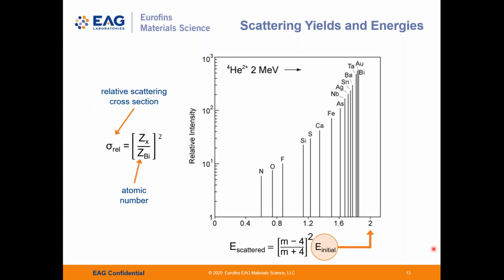Okay, some observations. Scattering cross sections are proportional to the square of the atomic number Z. As a consequence, there are greater backscatter yields for heavier elements, so detection limits improve significantly with increasing mass. There is an approximately 2 orders of magnitude difference in yield, and therefore sensitivity, between the lighter elements and the heaviest elements of the periodic table.